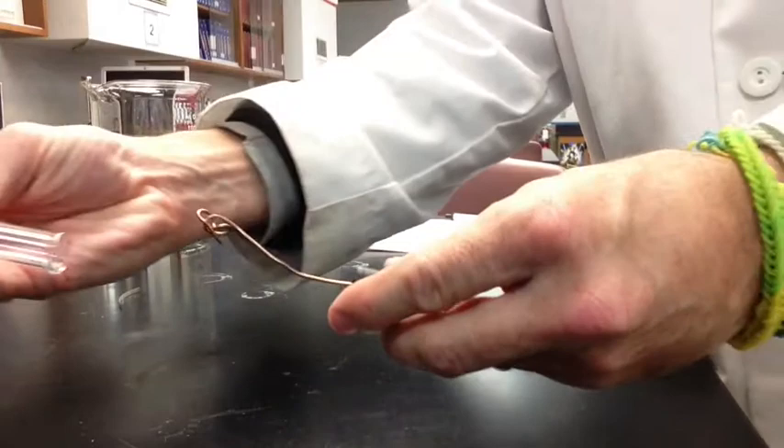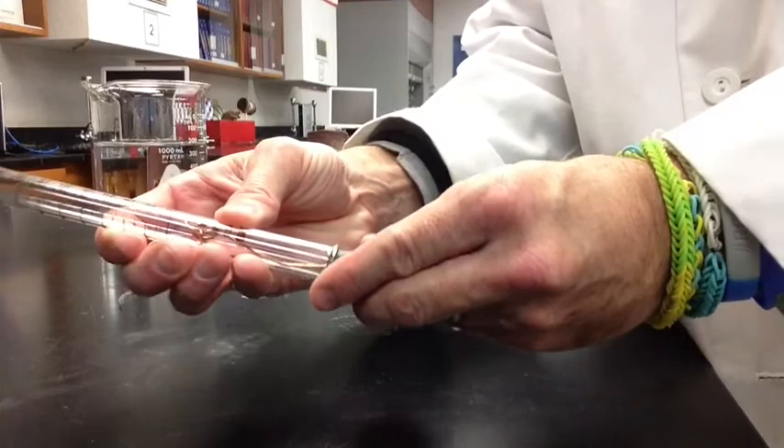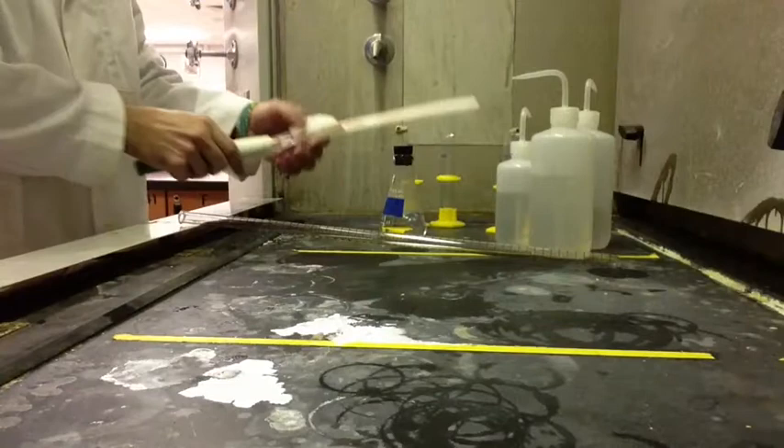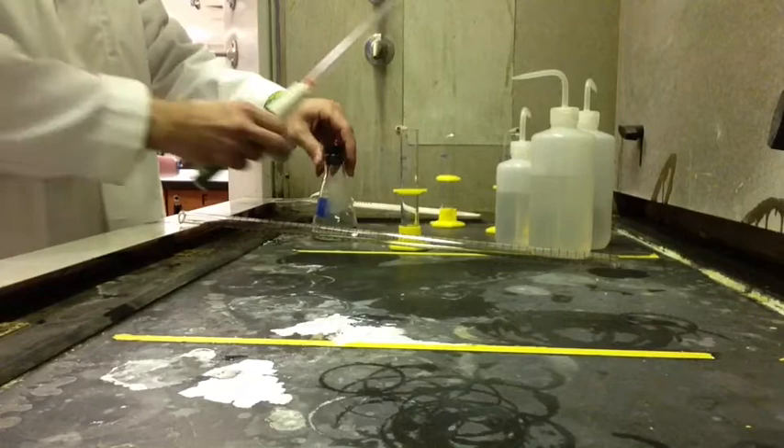Then you're going to take your magnesium strip and wrap it around the cage. The cage needs to be below the 50 milliliter mark so that it doesn't go into the marked areas on the eudiometer. You wrap the magnesium around the cage, and then that will hold it in place during the reaction.